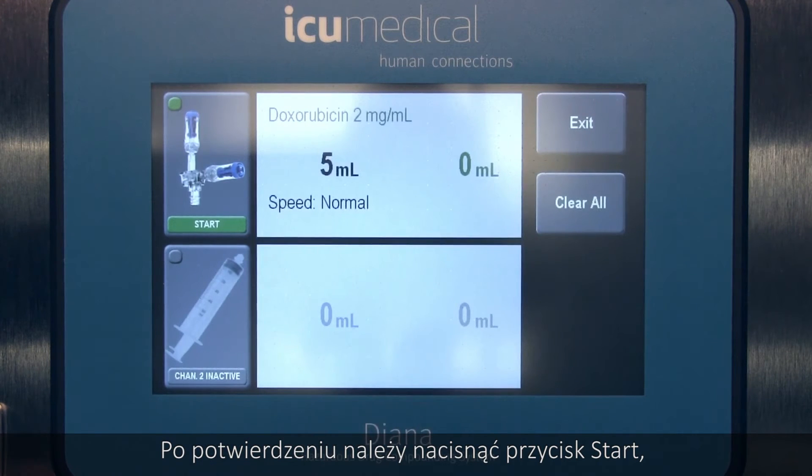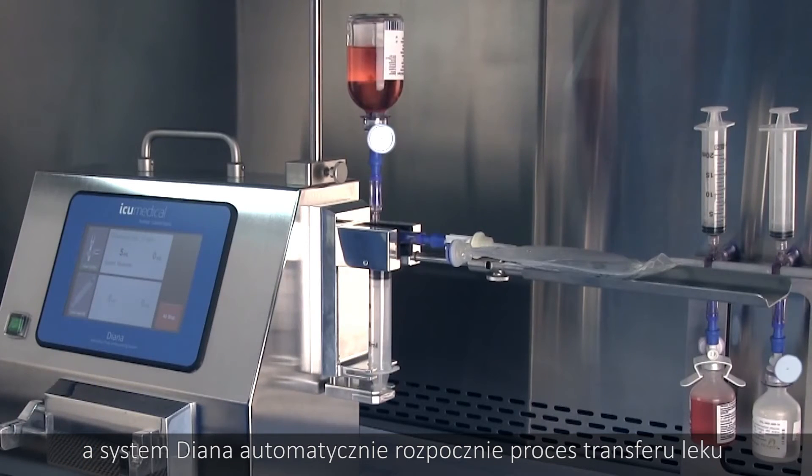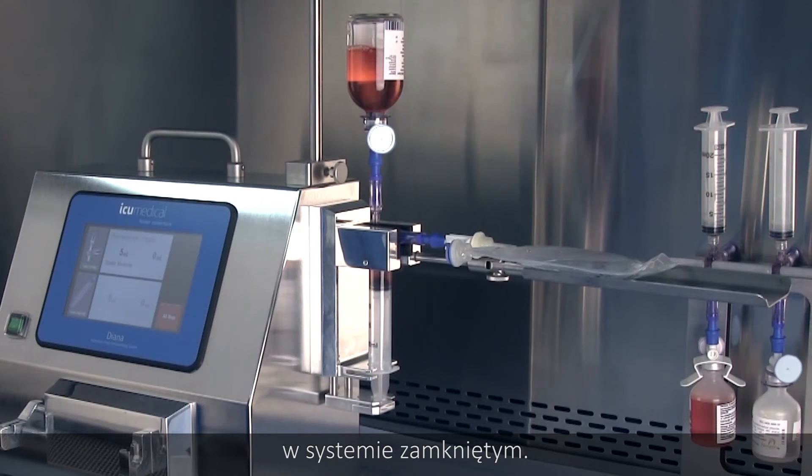Once confirmed, press Start and Diana will automatically initiate the closed drug transfer process.